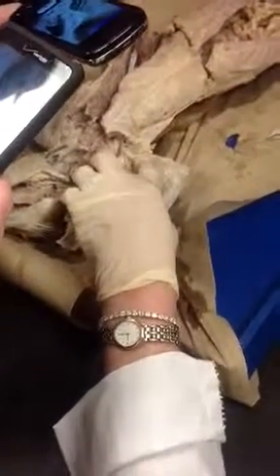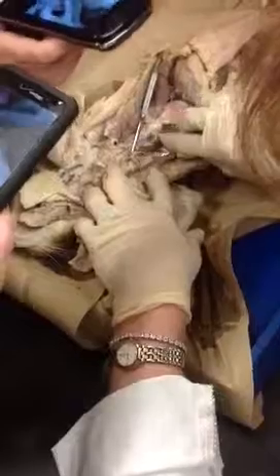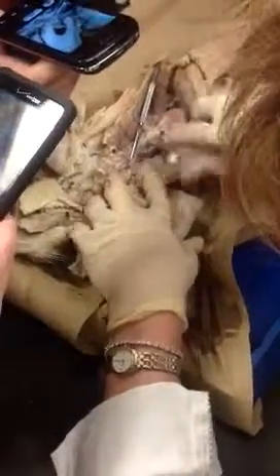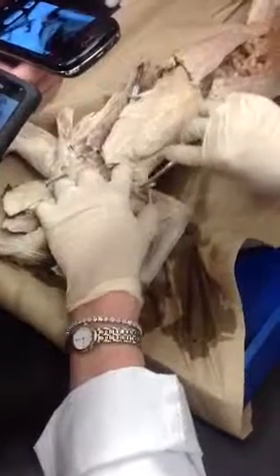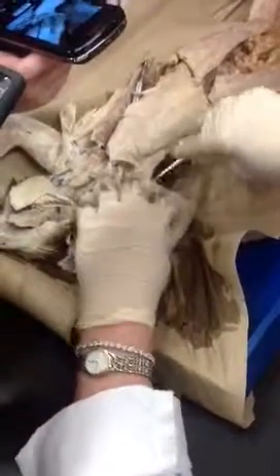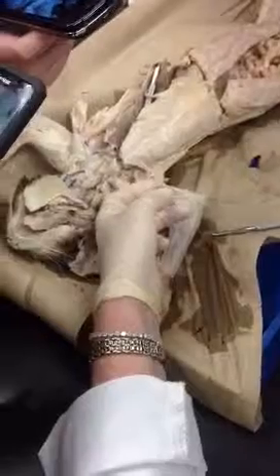Once you go past the subscapular, it's changed to the brachial. So right here, past those three we did, it is axillary. As soon as you branch off to the subscapular, it becomes brachial. Okay, you're going to follow the brachial, and yes, there are a few little bitty ones that split off here and there. We're going to get right down here, almost to the elbow. And again, you can feel free to pull those out if you want to.